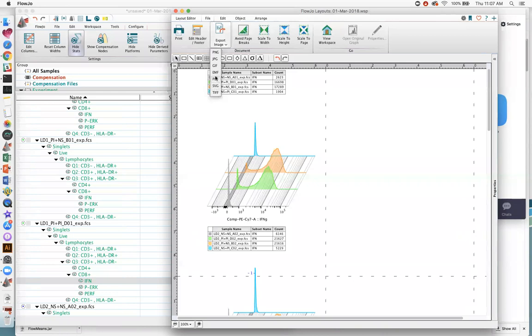You can also save it here as a PDF or a TIFF, and these TIFF and PDF are going to give you 300 dpi. The other nice thing about SVG, in terms of the resolution, is that you can expand or contract the graph without losing resolution. So it's a very versatile choice here.